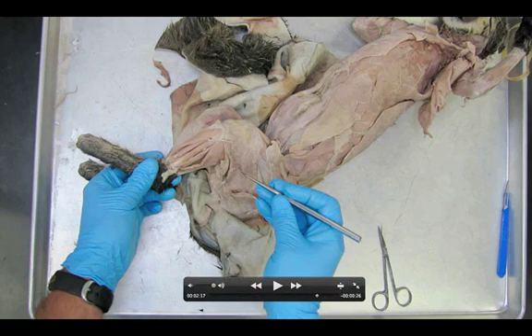Let's pause it right here and take a quick look at all the muscles that we should see. We see the gastrocnemius, we see the soleus, next is the peroneus, and up here is the extensor digitorum longus. The muscle that's on the very top is actually from the other dissection, number 14, which is called the tibialis anterior. That is all you have to do for this dissection. Keep in mind that you do still need to know the Achilles tendon down here, and the gastrocnemius can be seen from either side, as can the tibialis anterior.